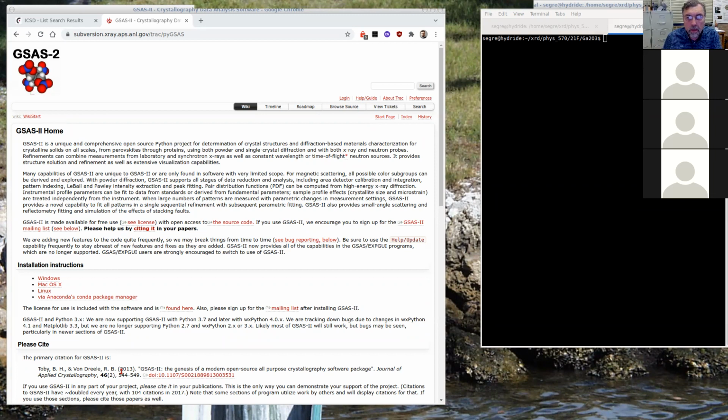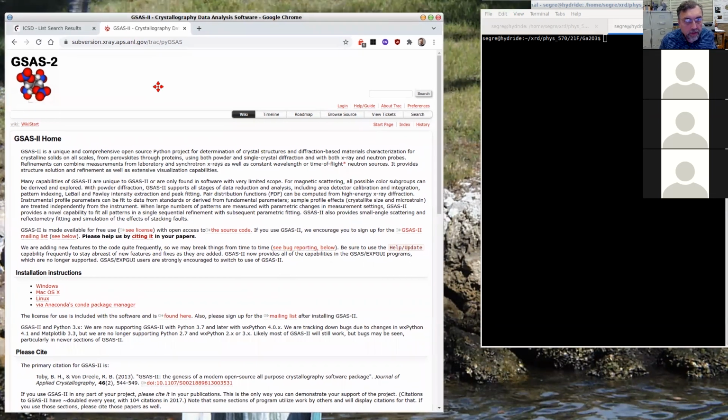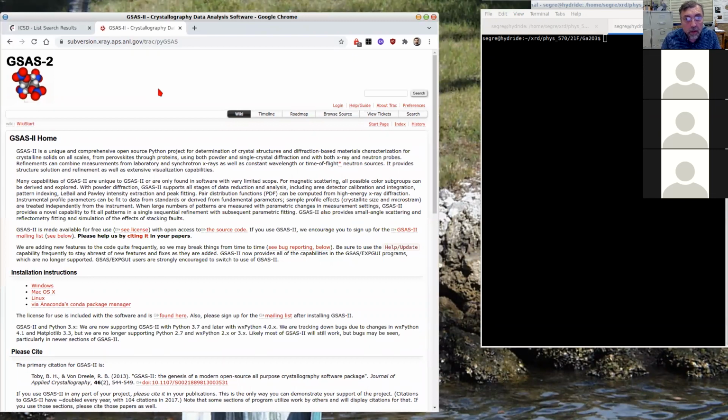Okay, so what I'm going to do today is walk you through how to run GSAS-II, and hopefully I'll be able to do a couple of examples for you and do them successfully. It's always a question, right? Sometimes you get them right, sometimes it just takes you a little bit longer. These should be fairly straightforward. So I have one example from 11BM, which is the powder diffraction line at the Advanced Photon Source, and we'll start with that.